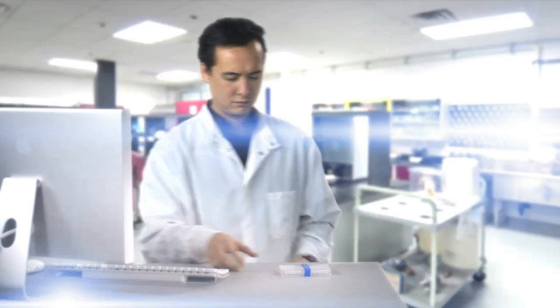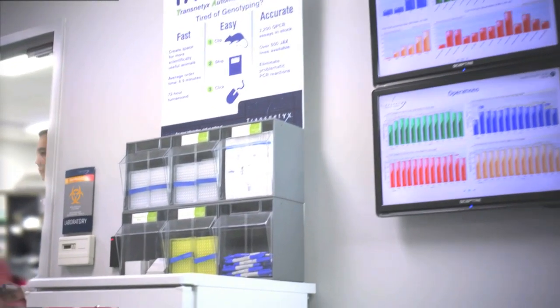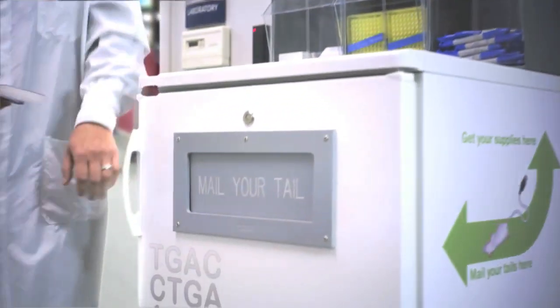Go to your secure account online and place your order using Quick Order. Then simply drop your plate into a tag center for FedEx shipping.